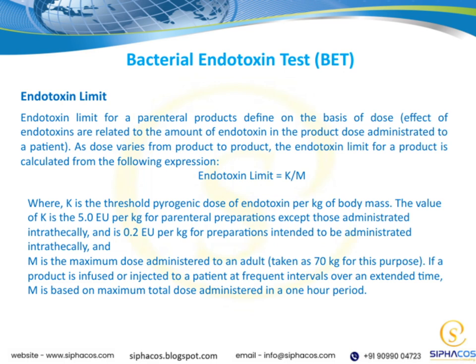This is where the bacterial endotoxin test, or BET, comes into play. It's a key tool for verifying that our endotoxin levels stay within these established limits. Overall, understanding this calculation helps us maintain safety standards in our pharmaceutical products and protect patients from pyrogenic reactions.